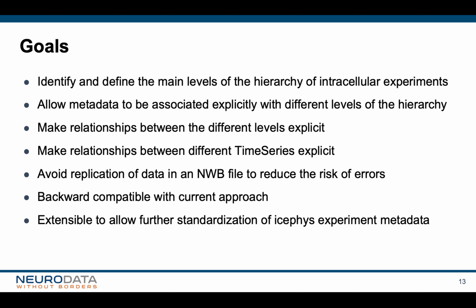The goals of this effort include that we wanted to identify and define the main levels of the hierarchy of intracellular experiments. We want to enable metadata to be associated explicitly with different levels of the hierarchy. We want to make relationships between the different levels explicit.